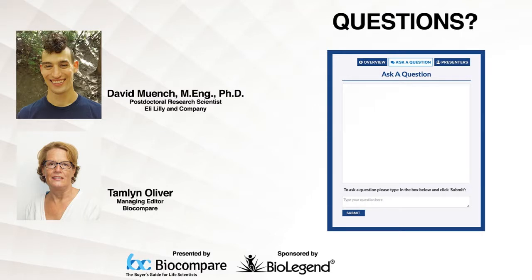Oh, good. All right, here's the first one. If neutropenic patients lack neutrophils, how did you analyze them? And did you analyze neutrophils from patients with GFI1 variants?